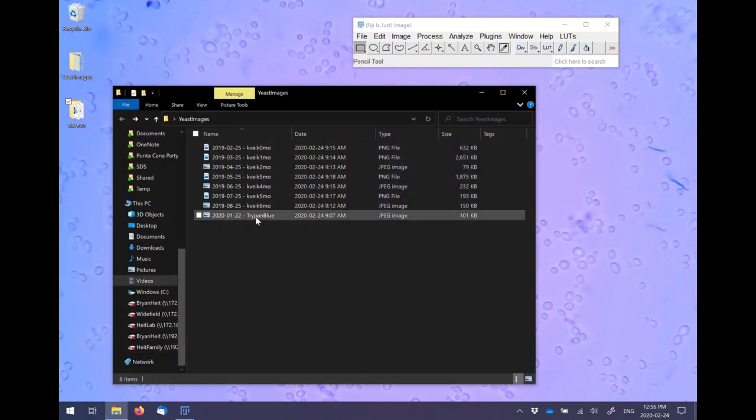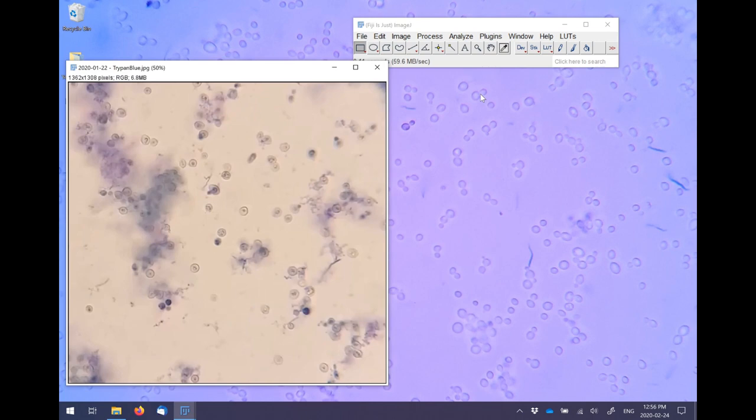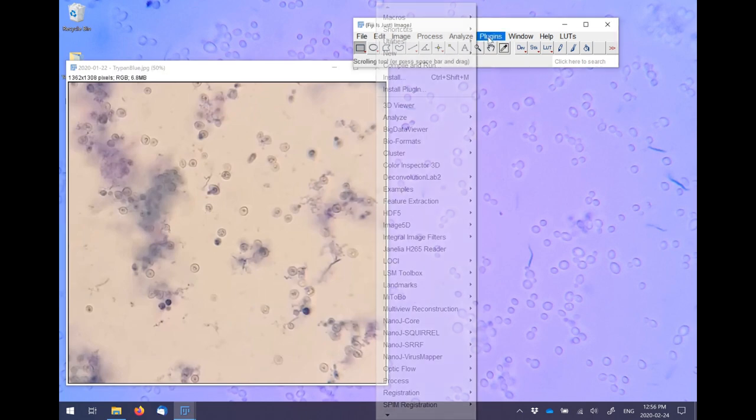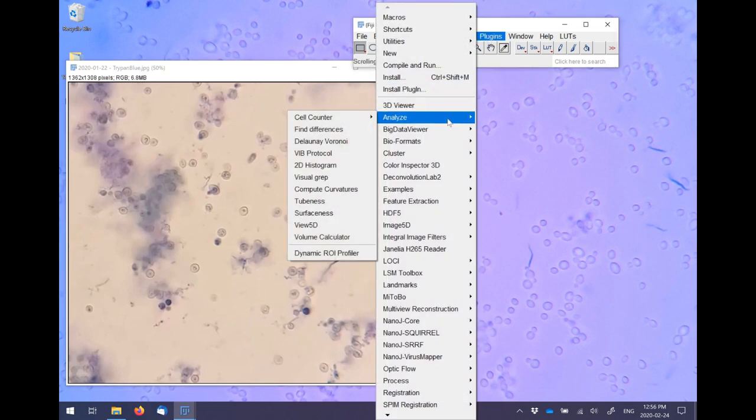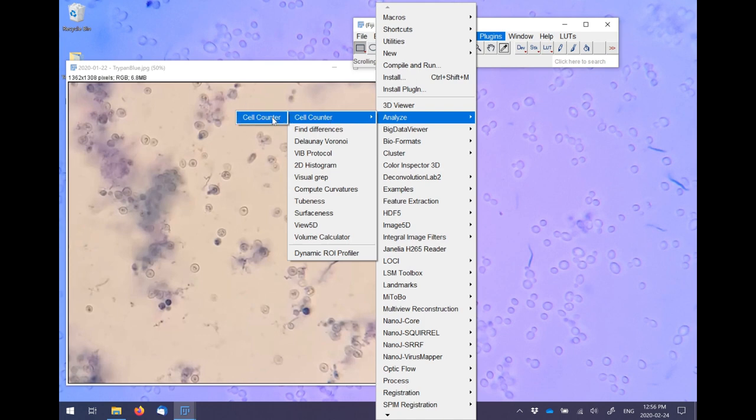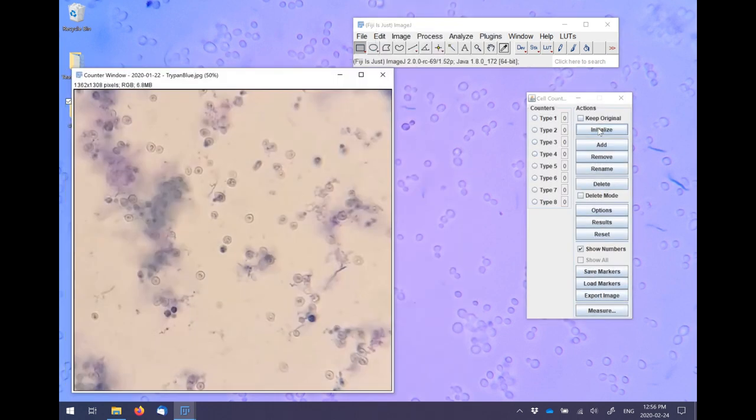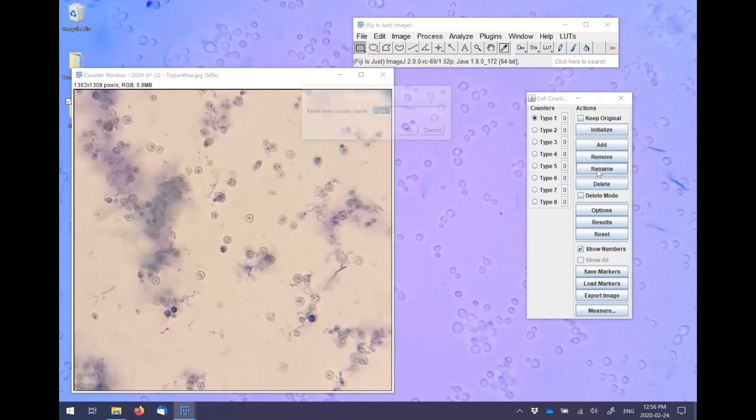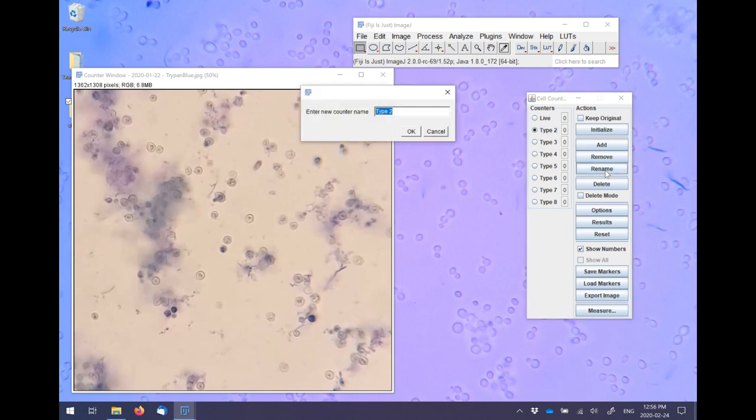So to start, open an image and then open the cell counter plugin. The plugin can be found under the Plugins menu within the Analyze submenu. First click Initialize, which will start the counter. Click on Type 1 and then on the Rename button and name the clicker something meaningful. So in this case, I'm counting live cells, so I'm going to name the clicker Live.